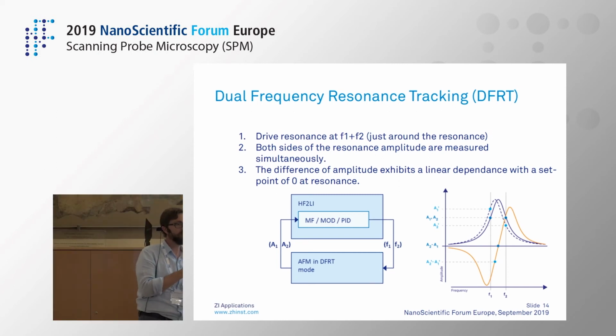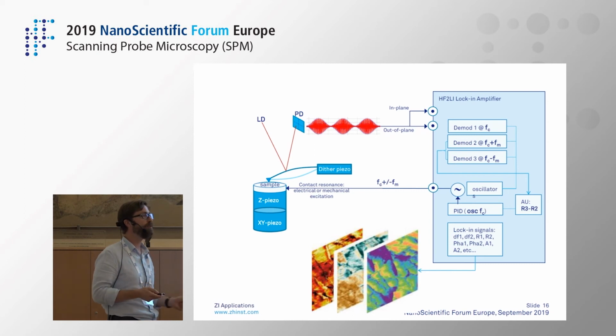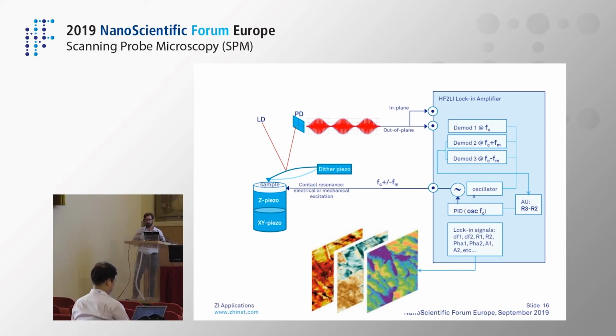Yeah, and we will actually have tutorials on that too. Typically you again need several demodulators with a certain modulation, but now it's not a frequency modulated technique, it's an amplitude modulated technique. You make the computation directly internally, digitally, then you act on the oscillator of the carrier, the one in the middle, and then you're not limited to 1 or 2 or 3, but you could actually do a lot of images at the same time. This is useful for standard PFM, for the out-of-plane component, but you can also do it for in-plane components, so you can have 2 images at the same time.